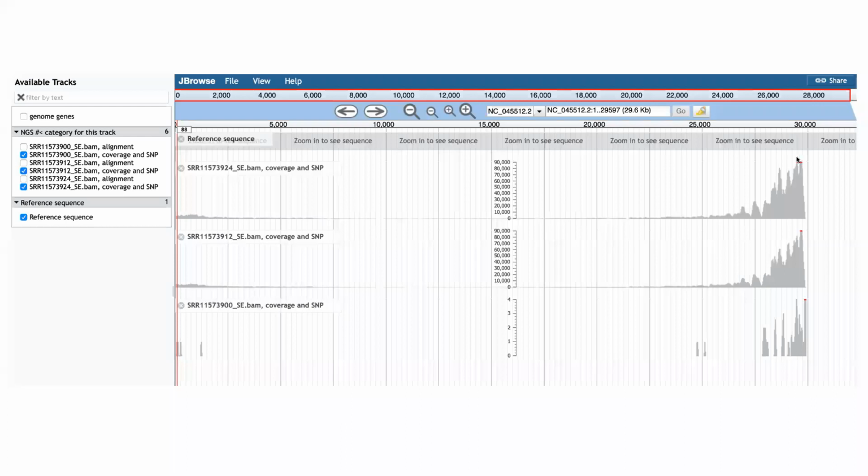Excellent. Joe, thank you for clarifying. It was a mock treatment. So, right, SARS-CoV-2 was not supposed to be found there, so we did not find it. As opposed to these other two, they were infected with SARS-CoV-2, and so we do see them, right? Because we're just mapping them onto the genome. We're not really measuring the different elements that are being expressed from the viral genome, because in this study, they're focused on the human genes. Okay.